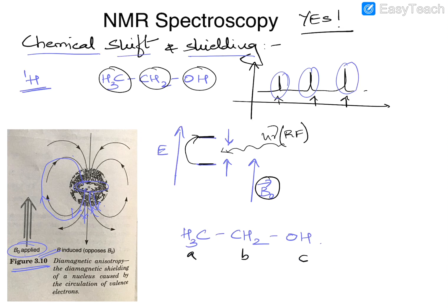So if we consider the electron densities around each of these nuclei, you can distinguish three different types of nuclei as A, B, C, which should show peaks at different characteristic frequencies. Having said that, it should also be noted that the difference in the frequencies is not large, and the difference itself is of the order of just a few hertz, when the external magnetic field applied is about 60 megahertz or above.